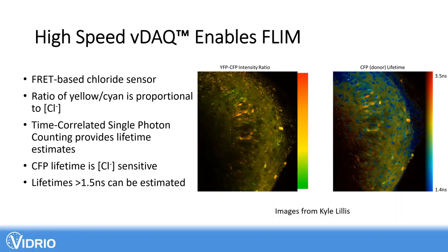So we're interested in feedback from the community about how useful that might be. He wrote all his own software to do these lifetime estimates. But John's going to show a little demo on how to do the photon counting now.